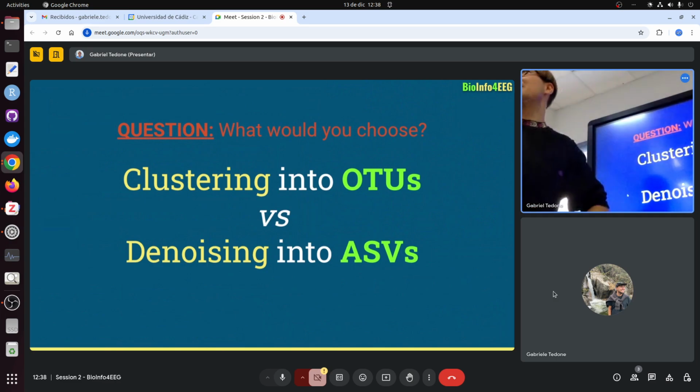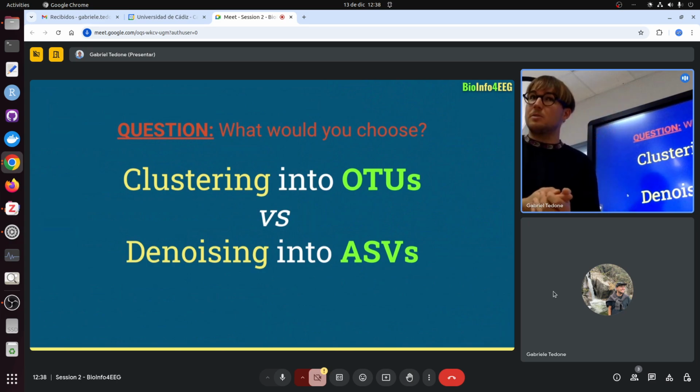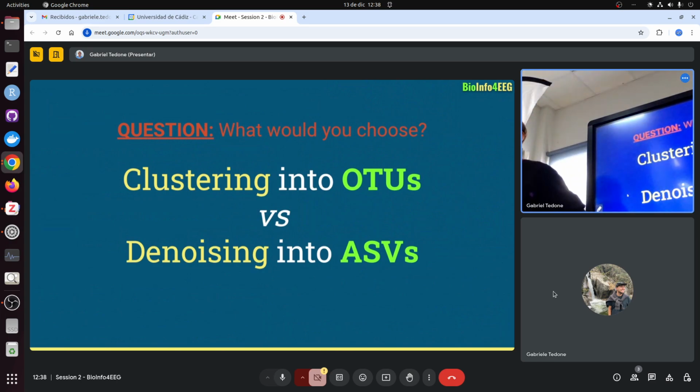I would do that. Before working all this year on this, I was really into ASVs, because I got into how the denoising happened. I was like, well, this is amazing. We can reduce the noise, get a clearer signal. But then the taxonomic resolution is so high. Do you really need that high resolution? So in the end, if I continued to analyze microbial communities, I would go with that mindset: it depends, and we will see.